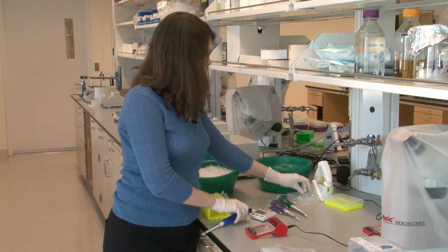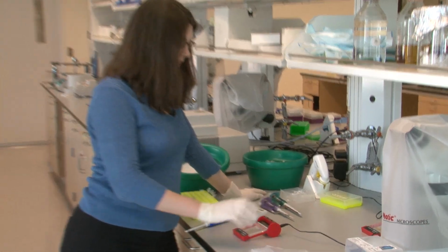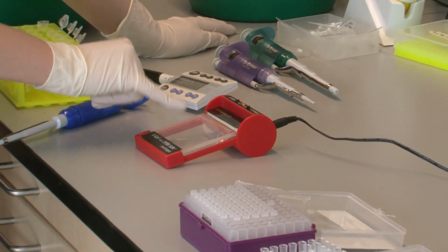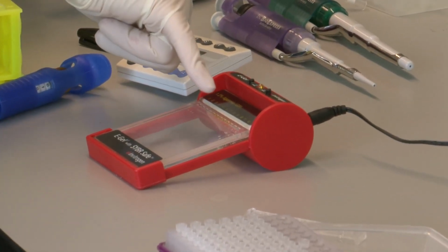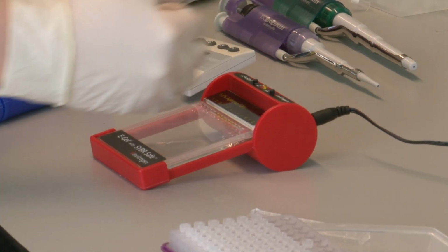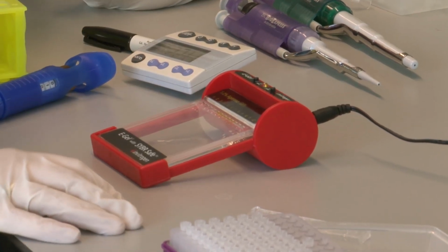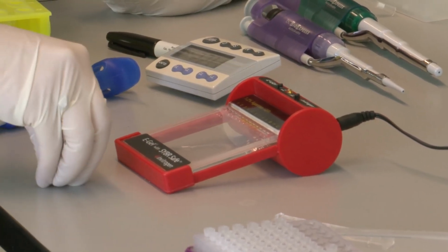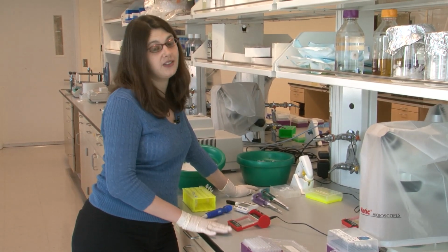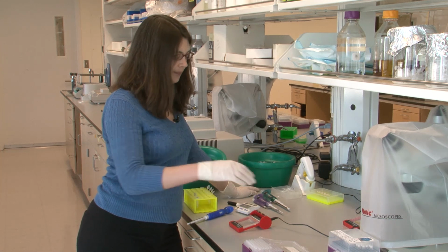So now what I'm going to do is hit this button, and that starts the current running through the gel. So now the DNA samples are going to move from the holes where we loaded them all the way down to the end of the gel right here. And so you'll see the orange dye progressing. The orange dye, remember, is not actually the DNA. The DNA is transparent and you can't see it at this step. But the orange dye allows us to see that the samples are traveling. Once the orange dye reaches the end of the gel, we'll expose this gel to a certain wavelength of light, and that will allow us to see the DNA.